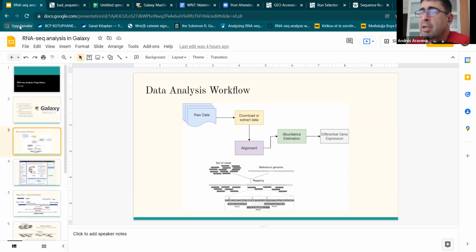And accessions are a little more stable, because one of the decisions that the NCBI made at the beginning is that every time they see something new, they put a new number. So if you have the same gene in a different version, it's a different GI, so things change every time. And that apparently was not such a good idea.